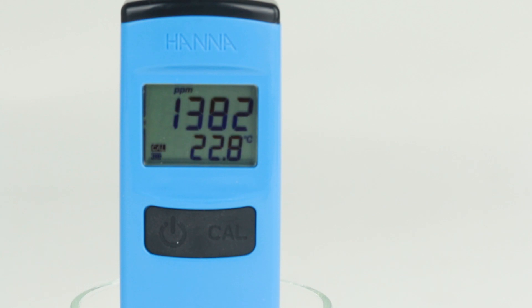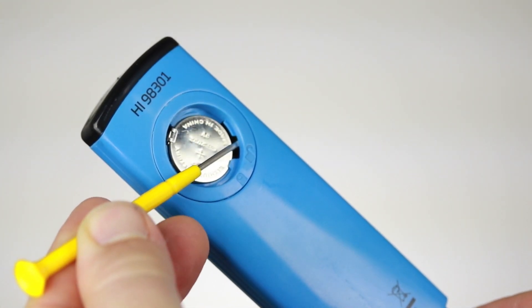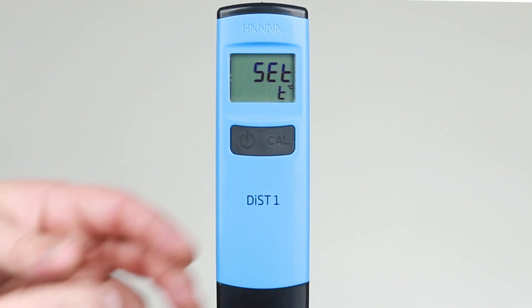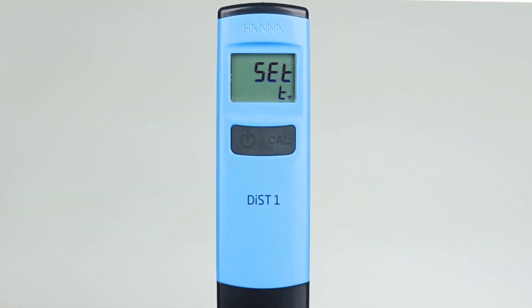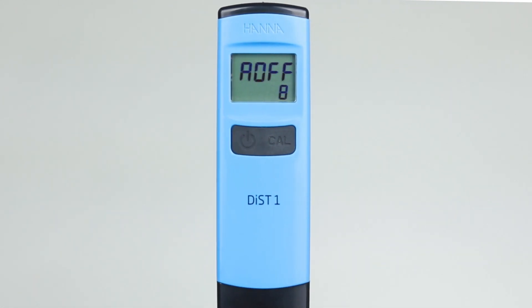If needed, the default settings for temperature unit and automatic shutoff can be adjusted. With the meter turned on and the battery cover removed, a micro switch inside the battery compartment is pressed to enter setup mode. The first setting displayed is the selection for temperature unit. At default, the temperature measurement unit is degrees Celsius. Pressing the CAL button changes the displayed unit to degrees Fahrenheit. Pressing the CAL button again changes it back to degrees Celsius. Pressing the ON-OFF button moves to the next setup option, which is for automatic shutoff.